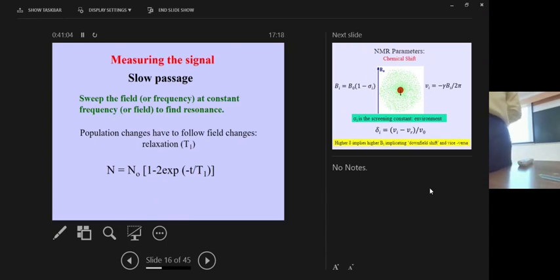Okay, now how should you do that? When you sweep through this magnetic, conventionally, it was found more convenient to sweep the field. Why? In the early days, they were all electromagnets. Electromagnets meaning you have an iron bar, and there is a coil going around it, and you pass current through that coil.